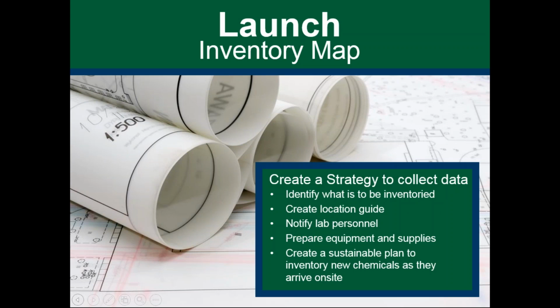We talked a little bit about this before, but it gets more specific than just non-haz or hazardous chemicals. Talking about consumables and kits, like I mentioned before. Some people don't really want to inventory consumables because there's such a high turnover rate that it seems kind of pointless to do that. Other people argue that stuff like kits do have hazardous chemicals in them, and they should be inventoried regardless of the time and energy that it takes.